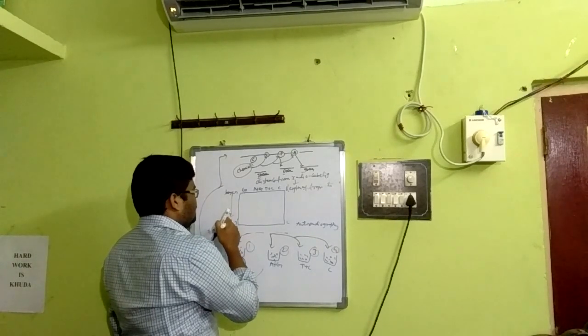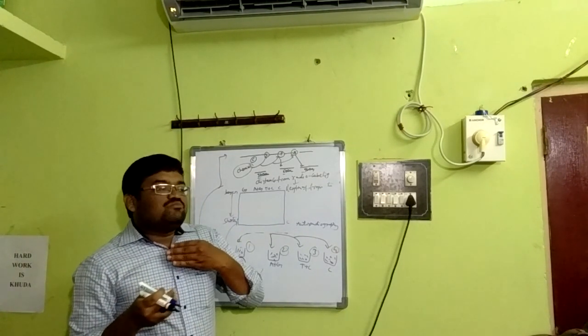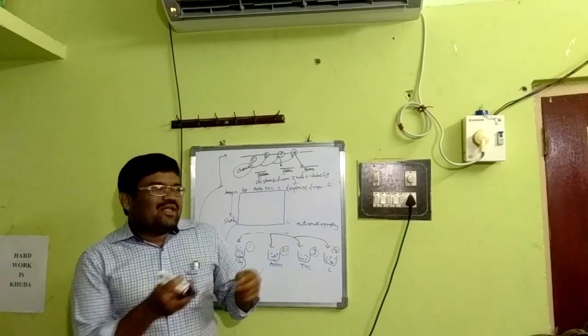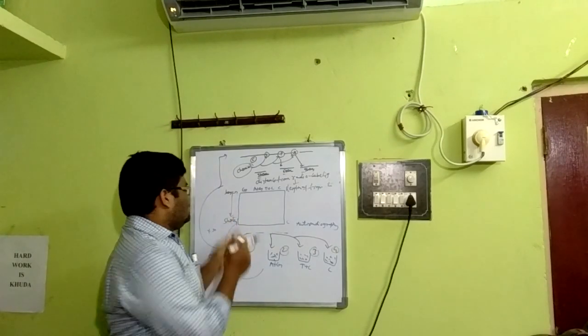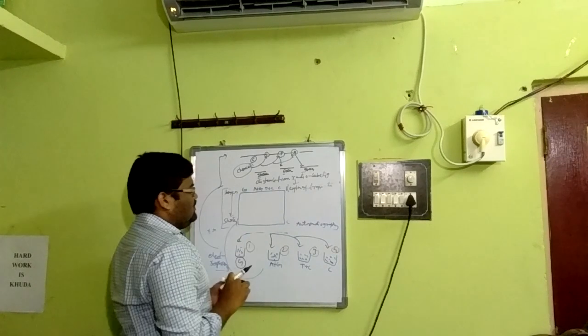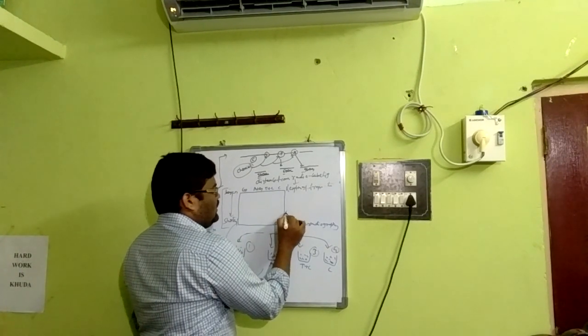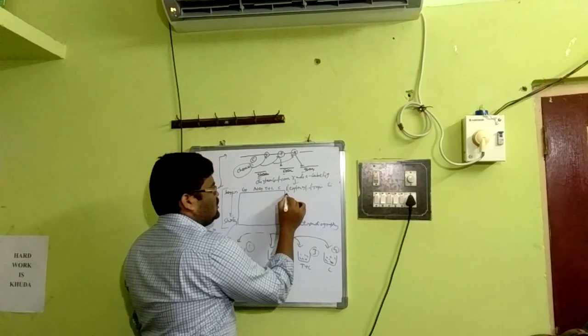This is very important. We knew that in electrophoresis the small fragments move farther, they move down the plate, whereas longer fragments stay at the beginning. So it's the same sequence we have to apply here. Accordingly, we get, for example, C, T, G, A, T, C, G, C.